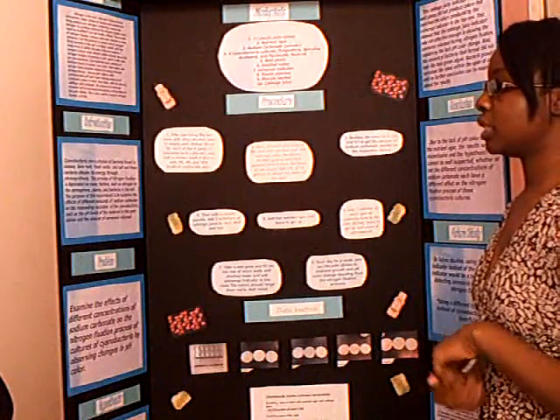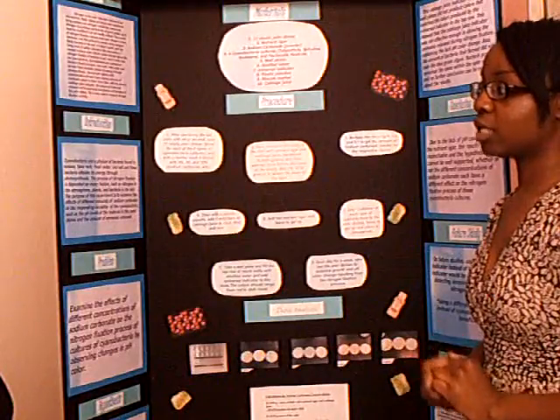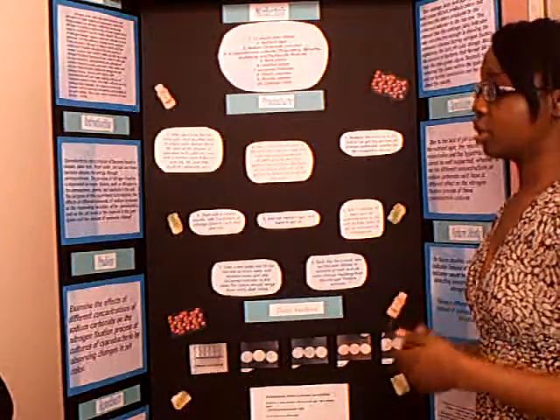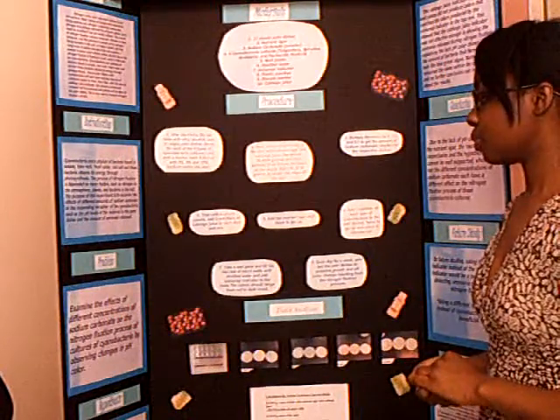The purpose of this experiment was to examine the effects of different amounts of sodium carbonate on the responding variables of cyanobacteria, such as the pH levels in the material in the petri dishes and the amount of ammonia released.